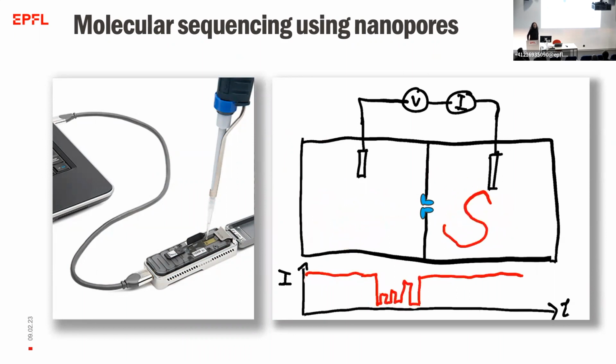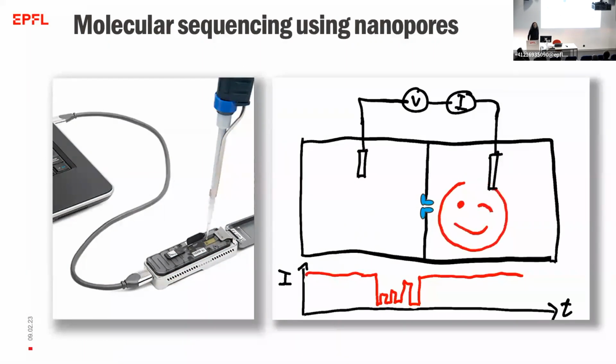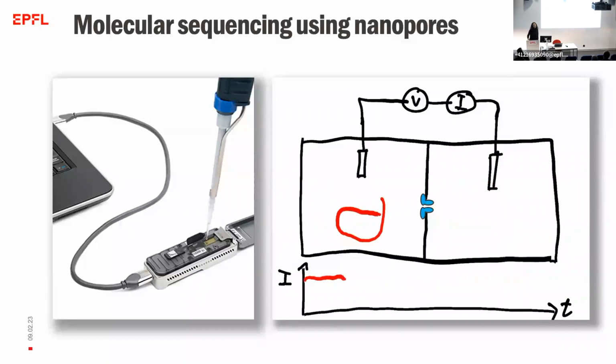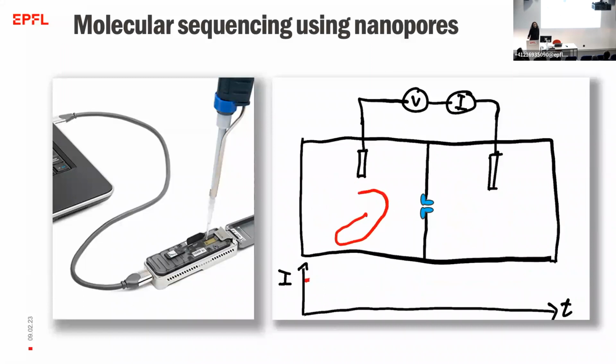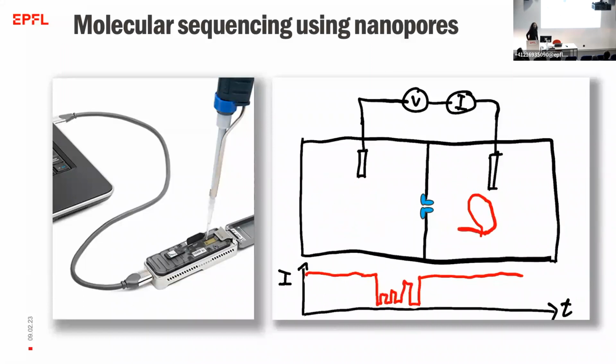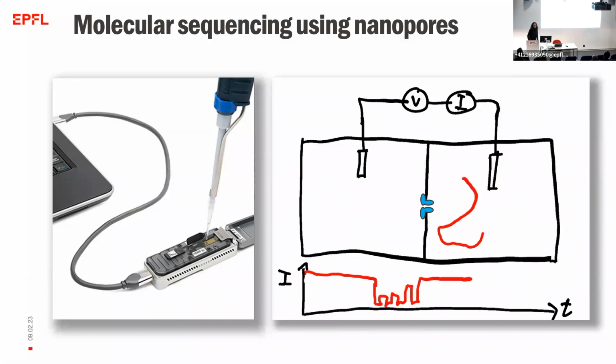It can sequence very long pieces of DNA. It can reread the molecules, but not at the stage that I will show you. They can be reread twice or a few times. And one of the most important parts is that it relies on a biological motor.